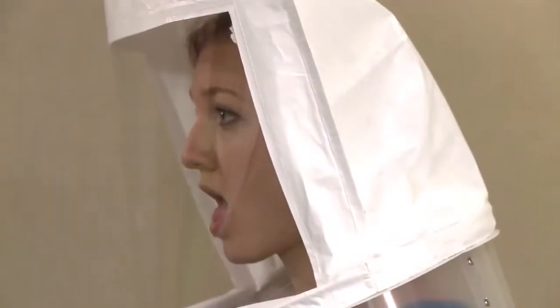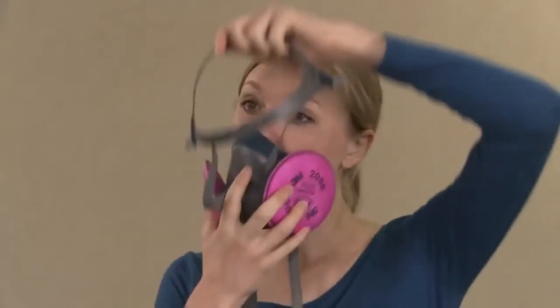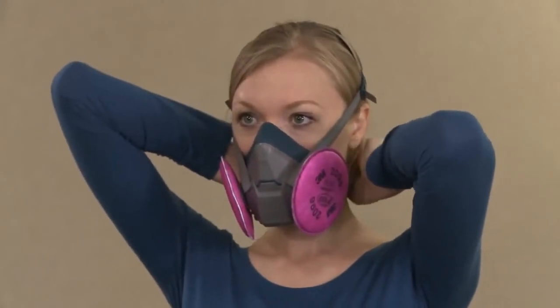Once it has been determined at what level, 10, 20, or 30 squeezes, you can taste the test agent, you'll remove the hood and wait a few minutes to clear the taste from your mouth. Rinsing your mouth with water may be helpful. Next, put on your respirator following all instructions for proper fitting, including a user seal check, as taught during your training session.